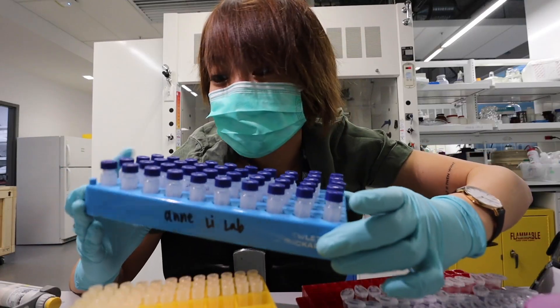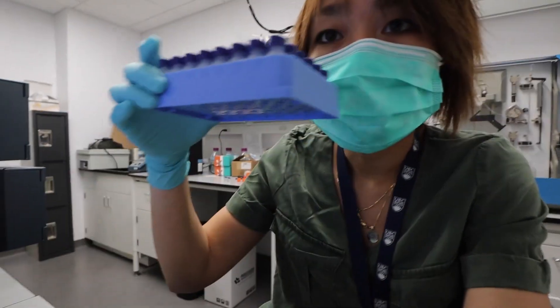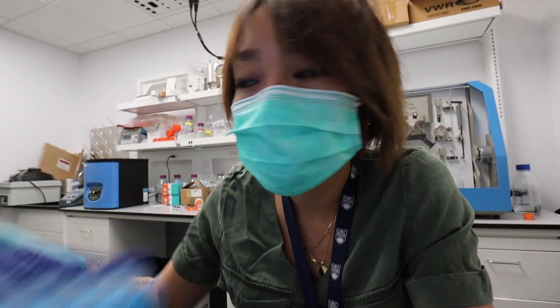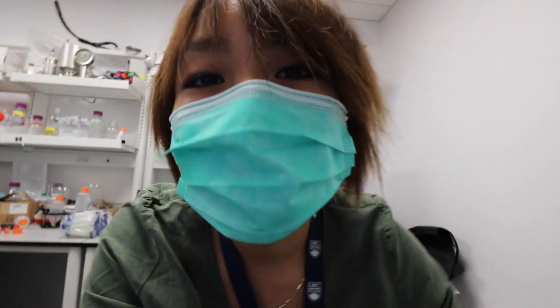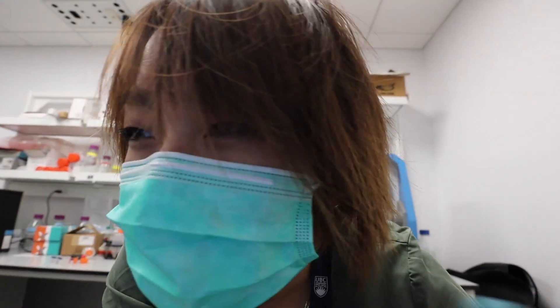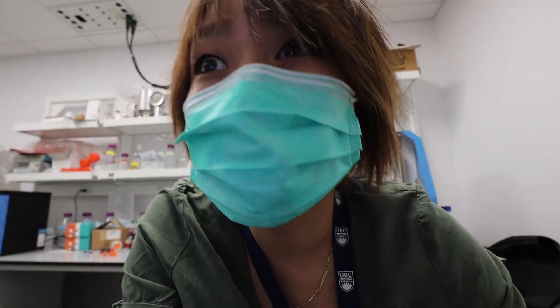Oh my god, I found a dog — this is half the dog, let's go look at the other half. One half, two halves. I'm just gonna put them into the UPLC now and let it run. Oh my gosh, I'm so tired already. It's 11:15 and I started gladly before nine — so just two hours of just processing samples.